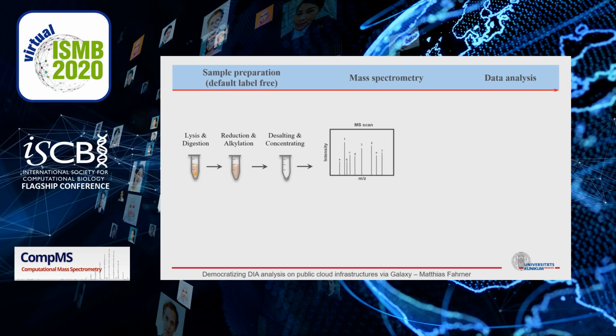One of the most commonly used methods in mass spectrometry is to select precursors from the most abundant signals in the MS1 and target those specific mass over charge values for a second scan. Prior to this second scan, the selected precursors undergo fragmentation, leading to precursor-specific MS2 spectra. Due to the intrinsic dependency on the most abundant signals in the MS1 scan, this is also referred to as data-dependent acquisition. DDA data can be analyzed using a variety of software, for example MaxQuant.